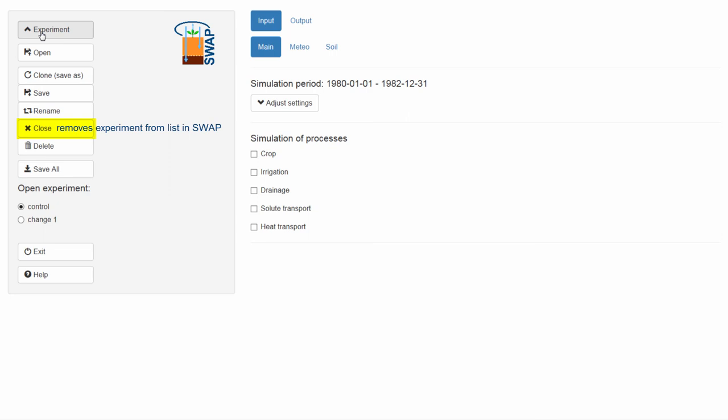Please do not confuse the button Close with the button Delete, which removes the entire experiment from your computer. This button only works for your own experiments. The default experiments within the program luckily cannot be removed from the graphical interface.